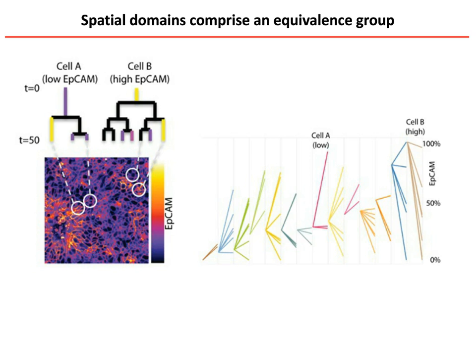Now, I've shown a schematic of about a dozen examples here where the y-axis is the level of EPCAM signal, and the x-axis is just before the experiment starts and at the very end of the experiment. So there are only 2 time points here, but it shows you the change through time. And cell A that I had demonstrated in the top left is indicated with this red representation.